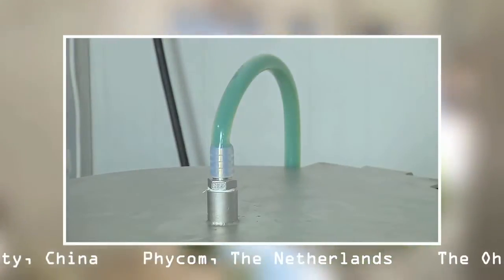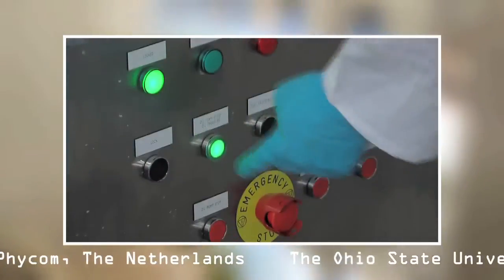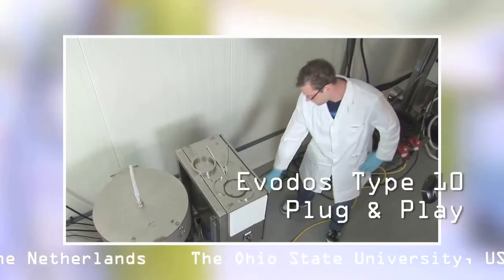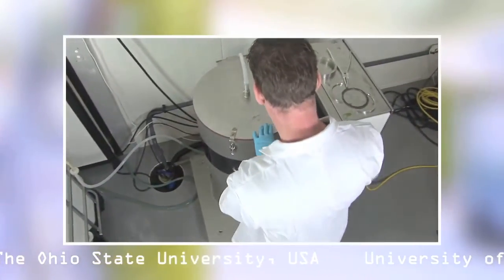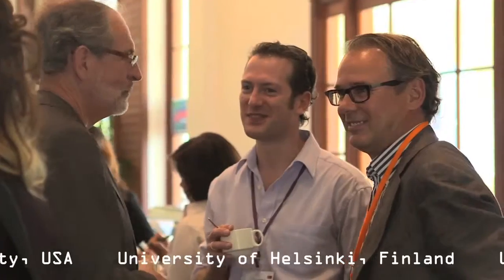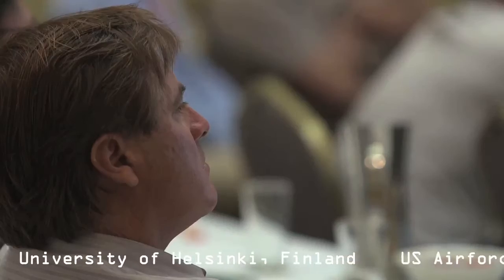The Type 10 is easy to operate. The machine is plug and play. You only level it horizontally, put in the power plug and there you go. Of course, the Evodos team assists you with the first runs, and they are always open for questions or recommendations.